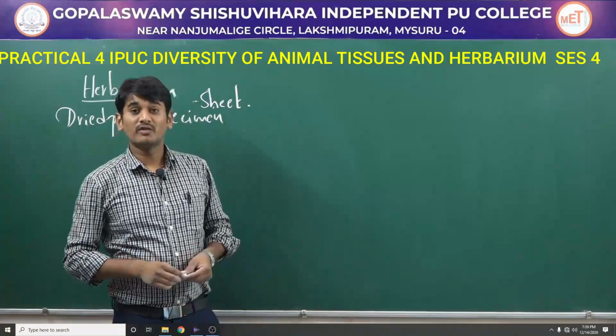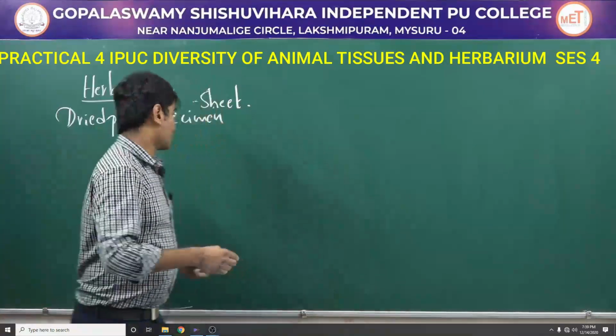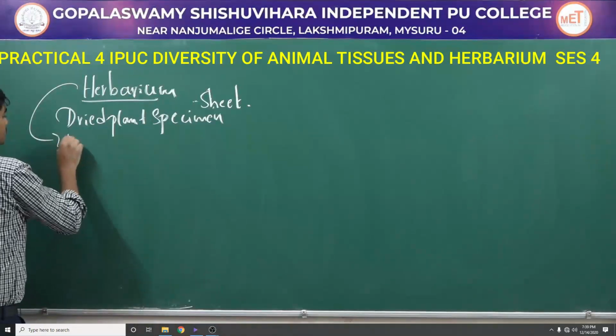And for the preparation of herbarium, some steps are involved.